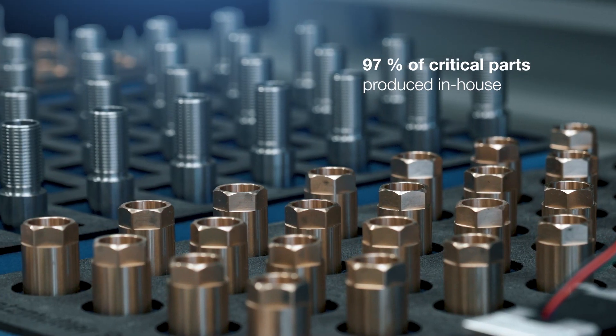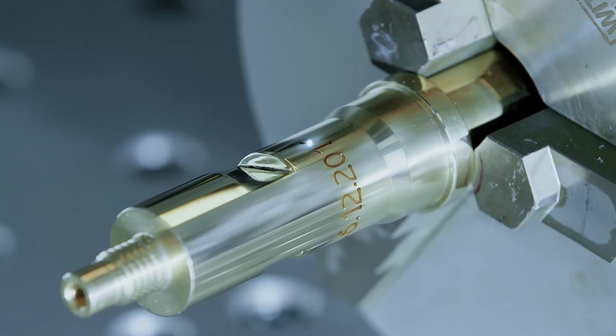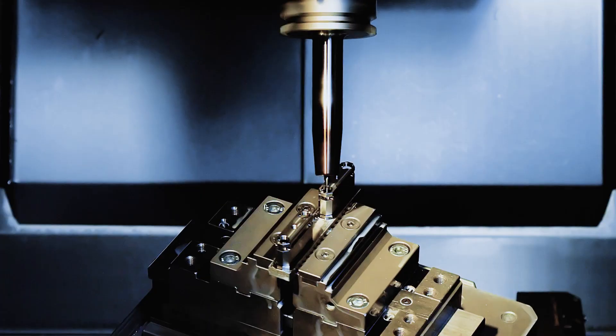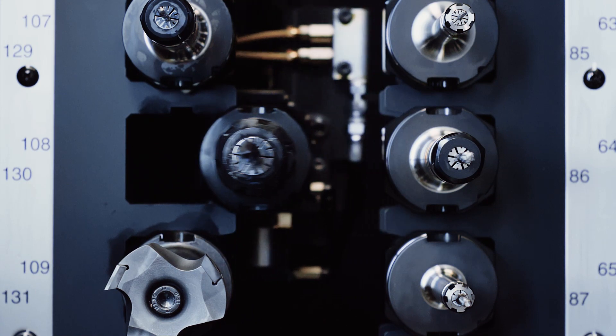97% of all critical mechanical parts are manufactured in Austria in our in-house production facility. That means we also challenge the status quo of high-tech production chains.